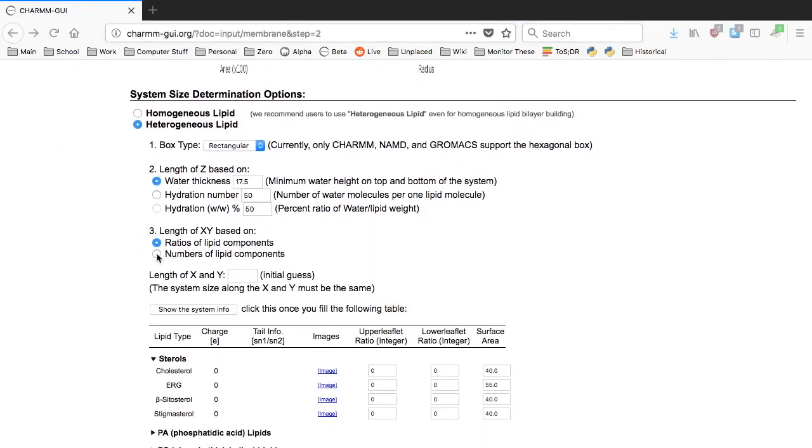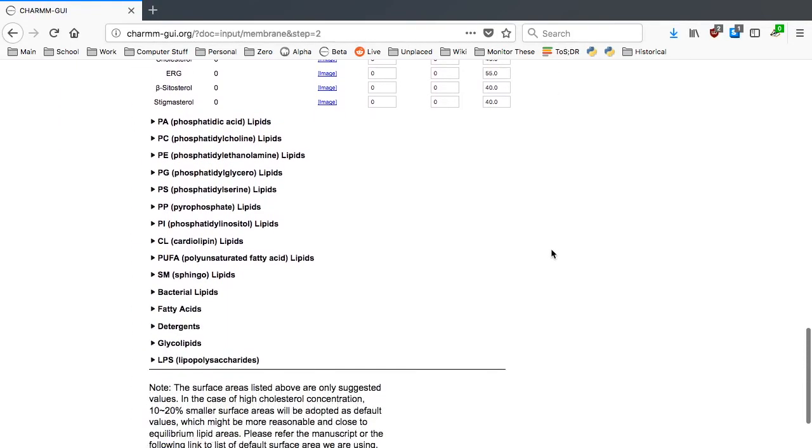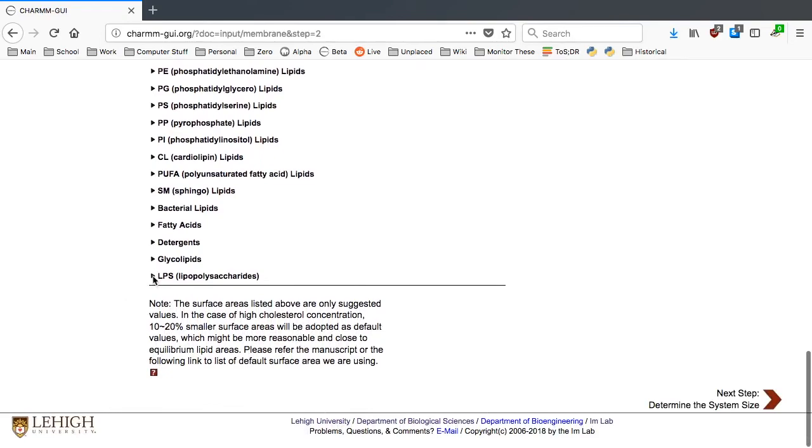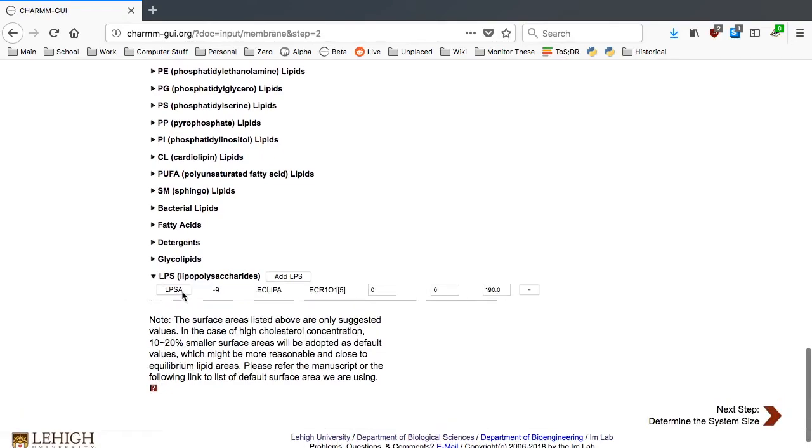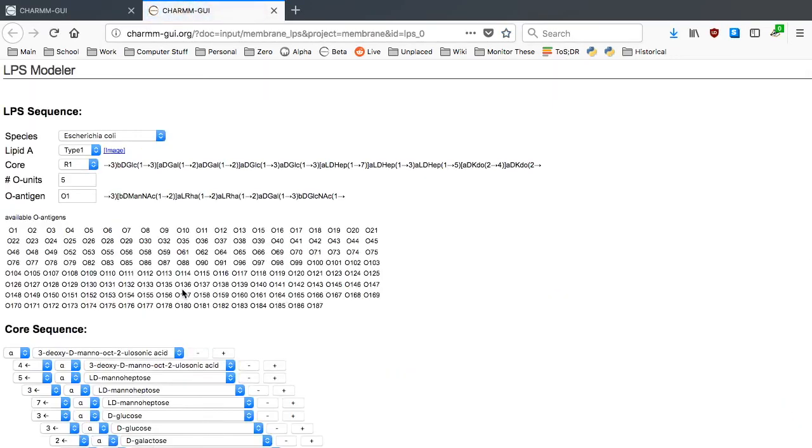First, select the Number of Lipid Components option and activate the LPS section in the table. Press the LPSA button to change the LPS sequence.